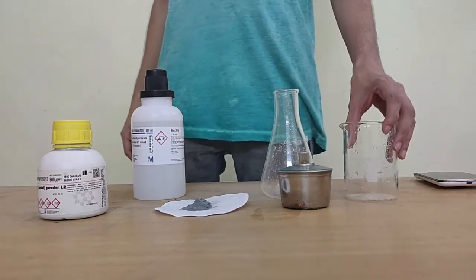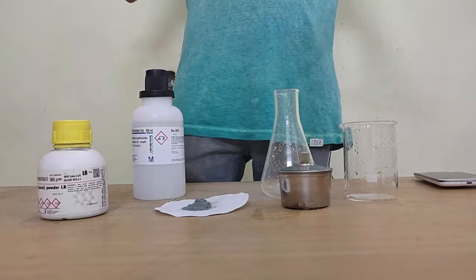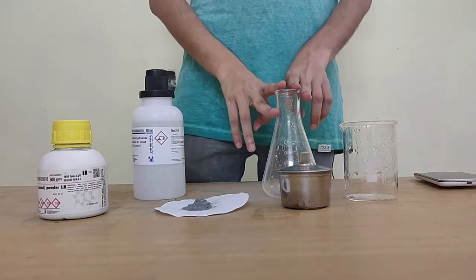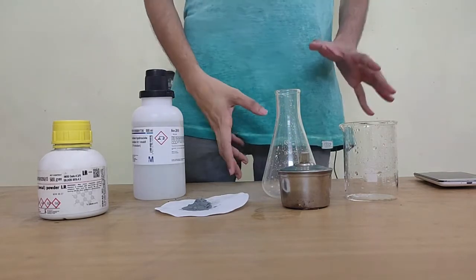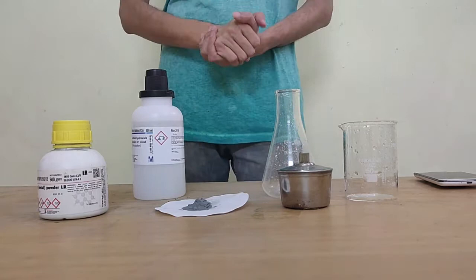Since I'll need that today I use that, and along with this a matchbox. Beaker is for support if I need it. So this is major apparatus: my reactants, my container and anything else that I need in the spirit lamp.